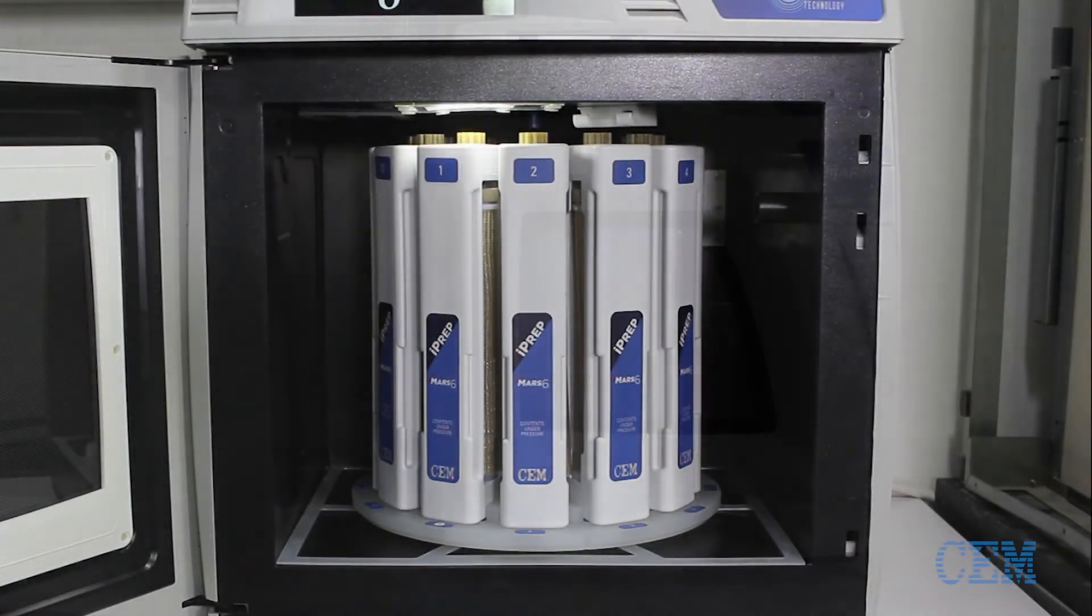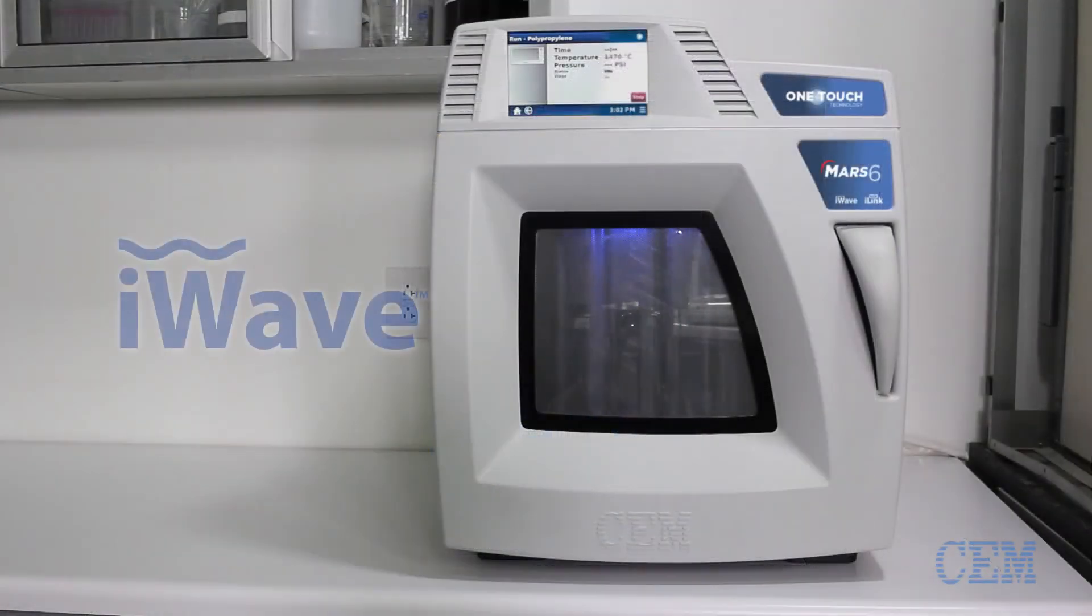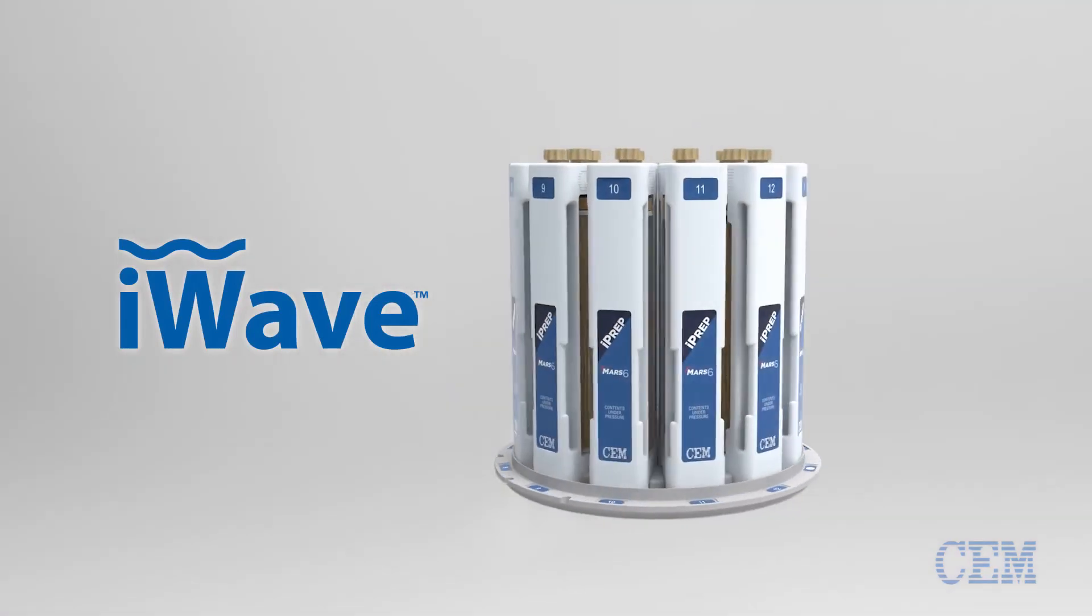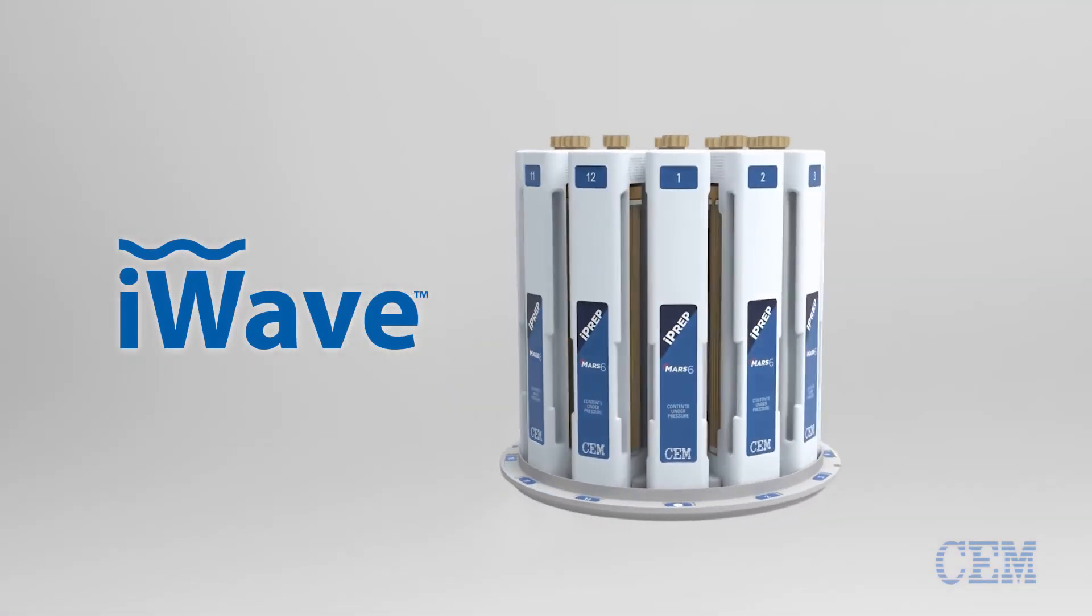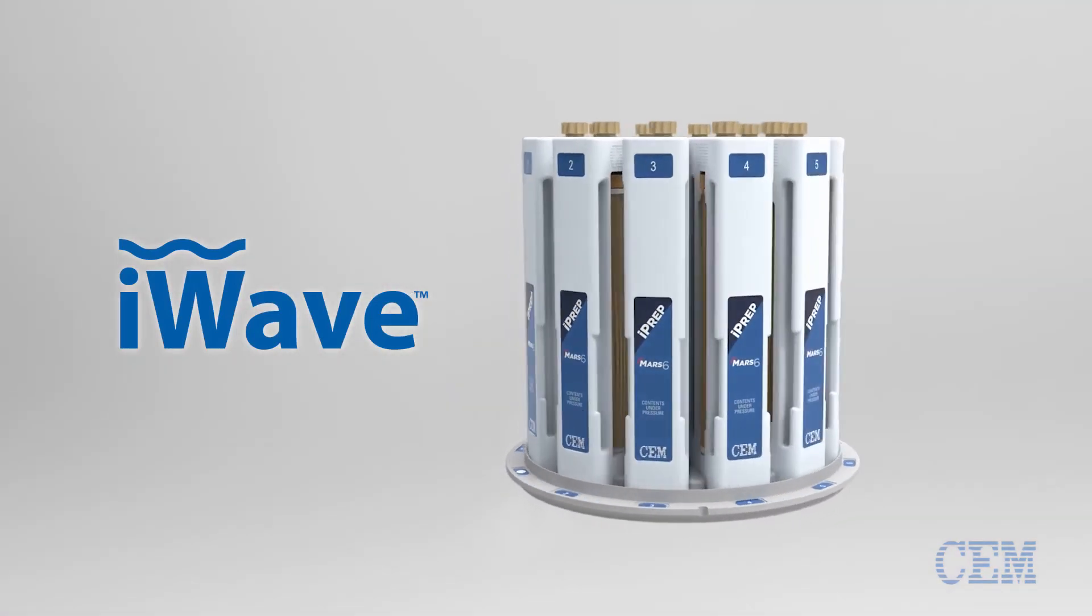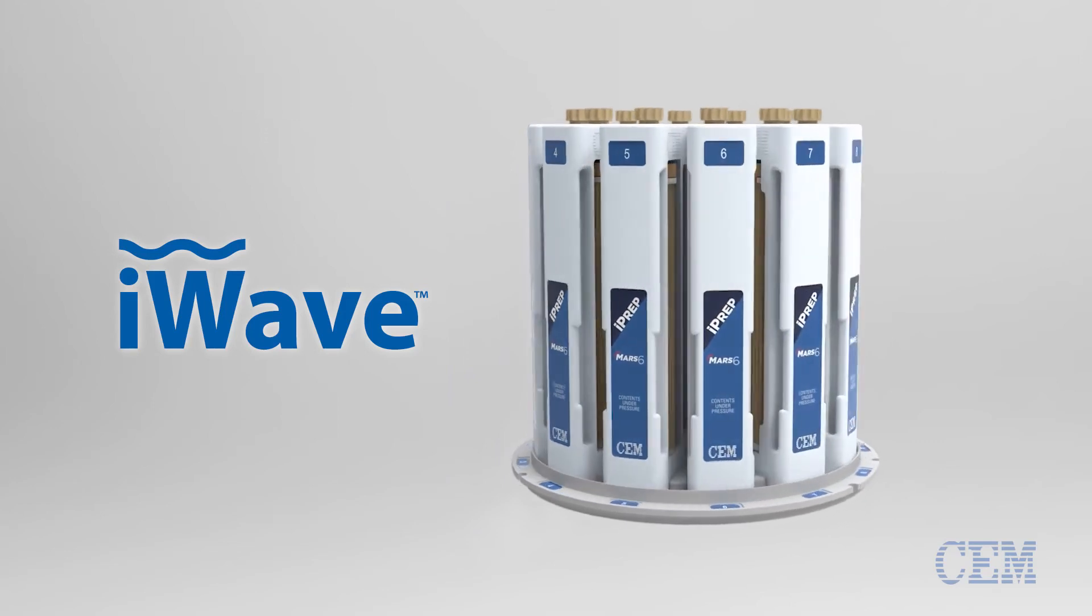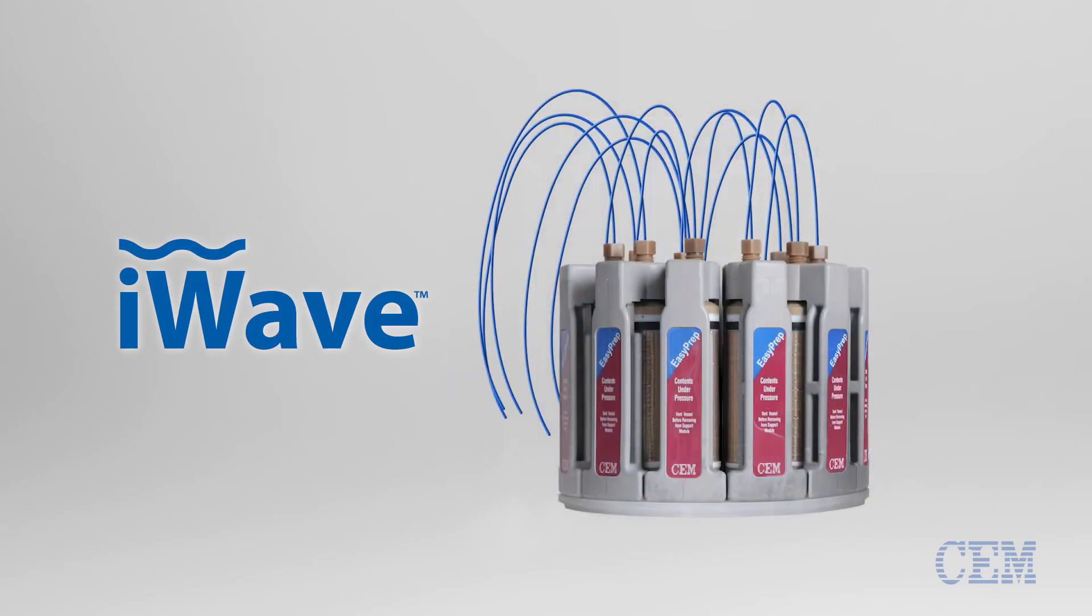I-PREP vessels are part of CEM's MARS I-Wave enabled instrument series. The MARS I-Wave series employs new state of the art I-Wave in situ contactless temperature control technology. Now every vessel is measured and controlled with all the accuracy of a fiber optic probe but without the connections. It's like having a fiber optic probe in every vessel.